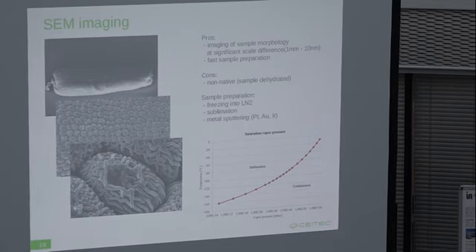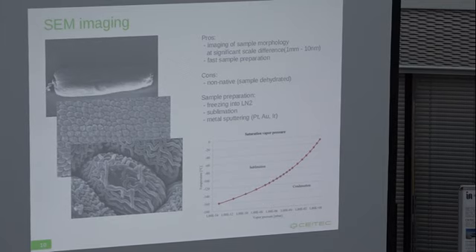This is a part of the phase diagram of water. In the standard scanning or transmission electron microscope, in the sample region, the pressure at the cryo conditions is around 1 to the minus 5 pascals, so that's 1 to the minus 7 in millibars. And if we have the sample at liquid nitrogen temperature somewhere here, you see that the water itself doesn't sublime from the sample. It's rather that your sample gets contaminated, and that's what you normally see.